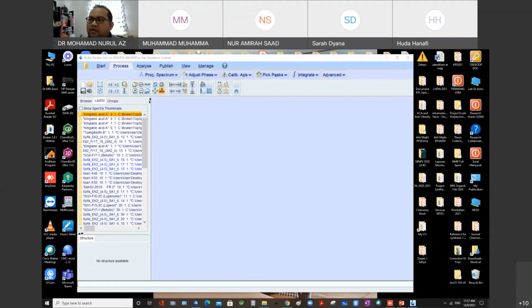You have to take note of this. When we do chlorination with POCl3, there is a possibility of proceeding with the chlorination and amination reactions. So they have two possibilities, 50-50 percent, that they will couple at chlorine number 1 or chlorine number 2. To determine which one is favored in this kind of reaction, you have to do HMBC to detect which chlorine they couple with. I hope you understand, Shahira and also Laksani.